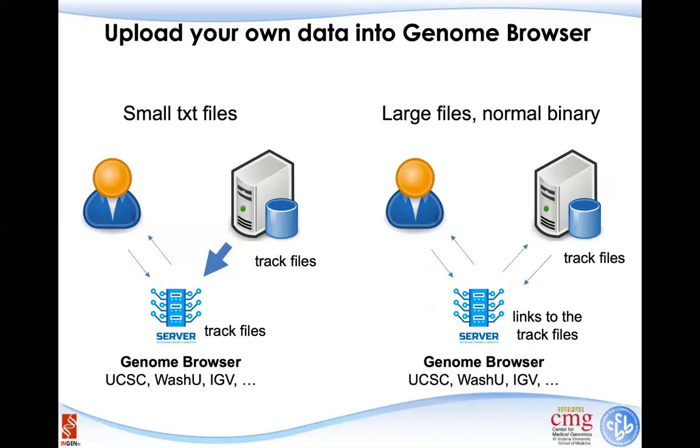This is not something where you just tell the UCSC Genome Browser that this is your laptop or desktop; that normally won't work. Normally, we need to put the data into a web server based architecture. I will show you where our data is, and that will allow the UCSC Genome Browser server to query the data in your server.